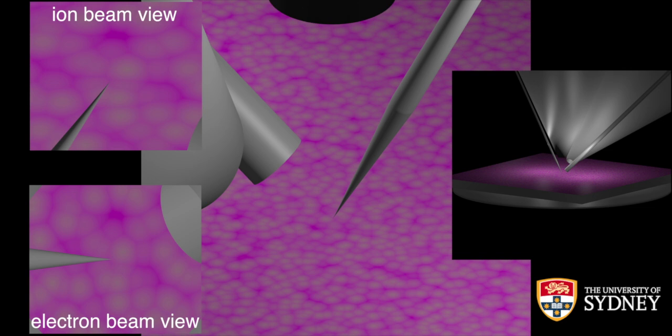That's good practice. And the very last step that you do is you move your micromanipulator needle a little bit back, just a tiny bit, and drop your stage, and then move the needle to the stage if you can.